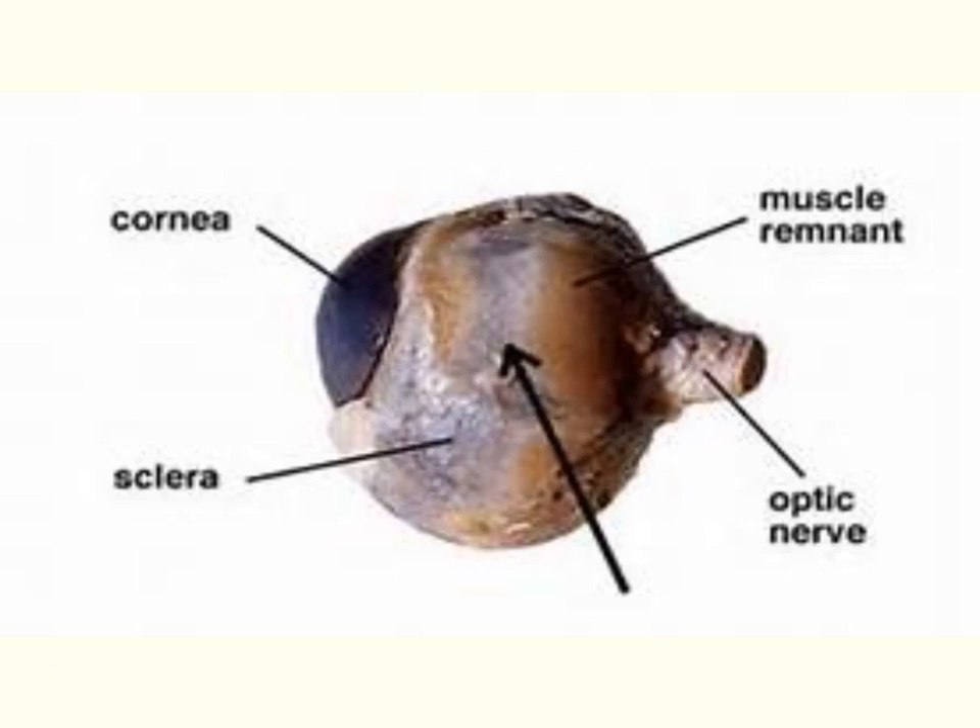In addition to that thick fat layer, you'll also see some brown tissue. That's going to be the remnants of various muscles that control the eye — they move the eye up and down and right and left.